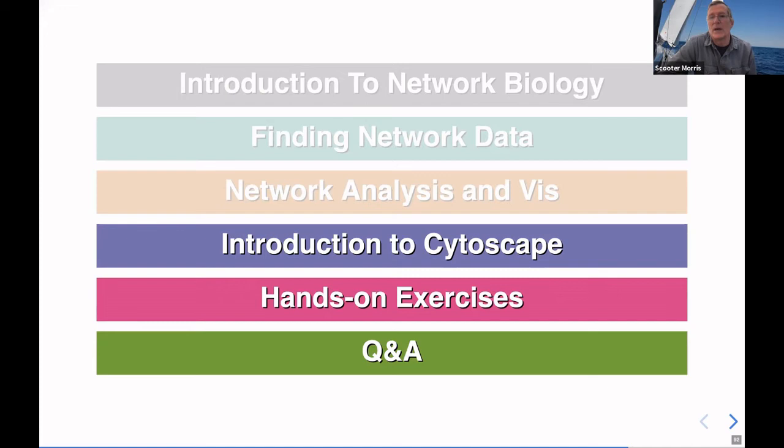I'm going to download, let's say I'm going to use STRING, the known protein-protein associations. And then what I see based upon protein abundance is that this node in this particular condition that I'm interested in has a substantially lower abundance than, I guess you could consider it, the non-disease condition or non-experimental condition.